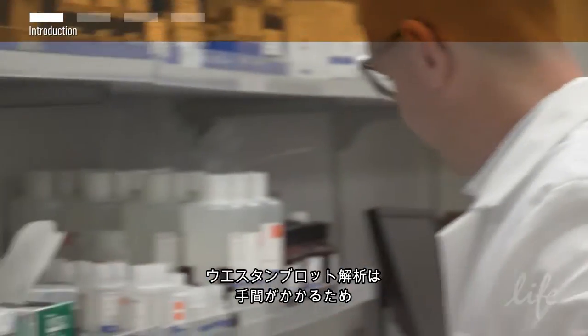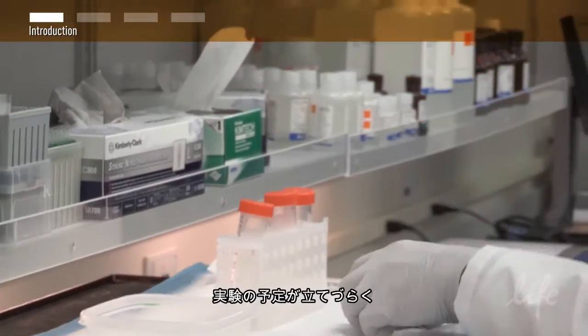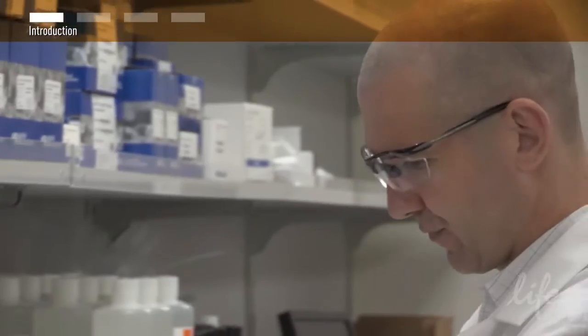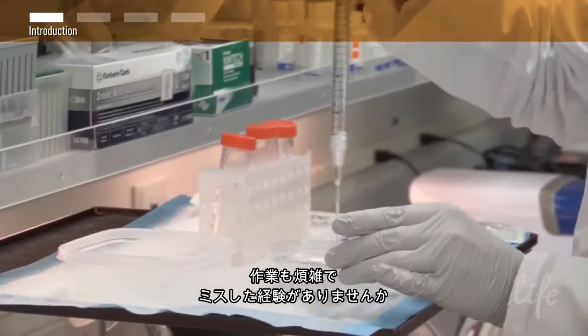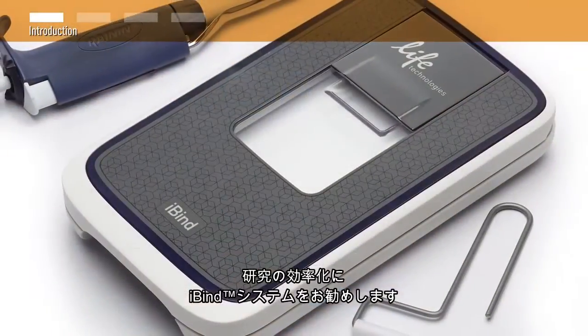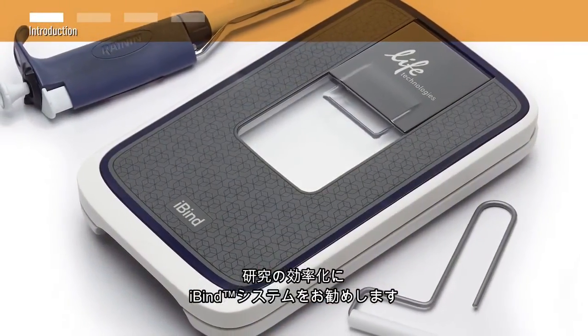Are your Western blots interrupting your busy schedule? Do you feel like you're babysitting your blots? Have you ever lost track of where you are in the protocol, compromising ideal results? If so, check out the iBind Western system for your next Western.